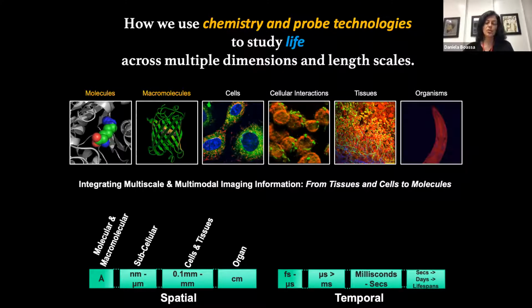The expectation is to enable biomedical researchers to follow biomolecules, requiring resolution less than 10 nanometers and supporting the ability to do supramolecular imaging throughout a continuous field of view as great as 100 microns wide. So this range that we refer to as the mesoscale is required to observe and map molecular constituents in their cellular and tissue context.